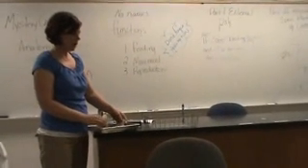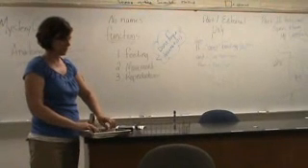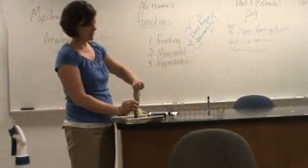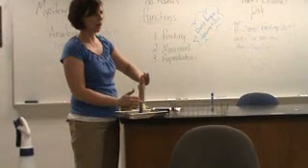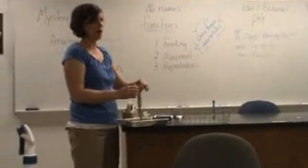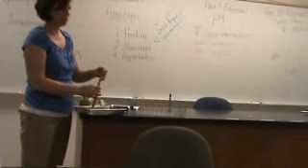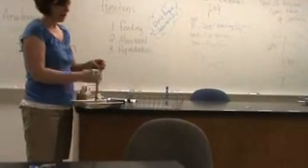Say, hey, why don't you flip it over for me? And go, wow, that's an interesting observation. Look at the difference between this side and this side here. Maybe point out the color pigmentation, that on one side it seems to be more plentiful in pigmentation than the other side. What could be a function of that?